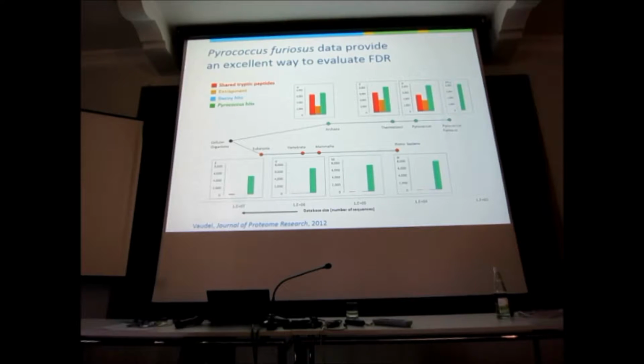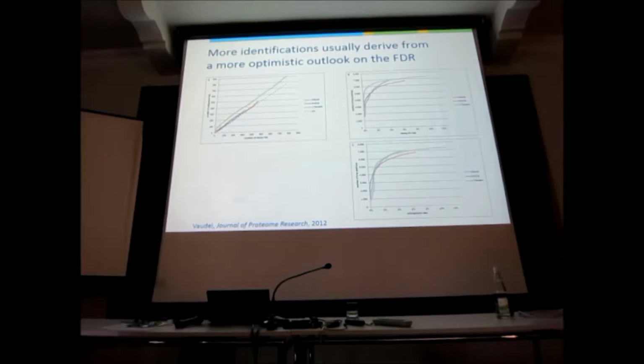Yeah? Now, people have tried to fix that. So, for one thing, you can try and use a better search engine. So we tested 3 search engines. We used Mascot, of course, everybody uses Mascot. We use OMSSA, which is known as a very conservative search engine. It doesn't give you many results, but it tends to have good control of FDR. And we use X!Tandem, which typically gives you more hits.